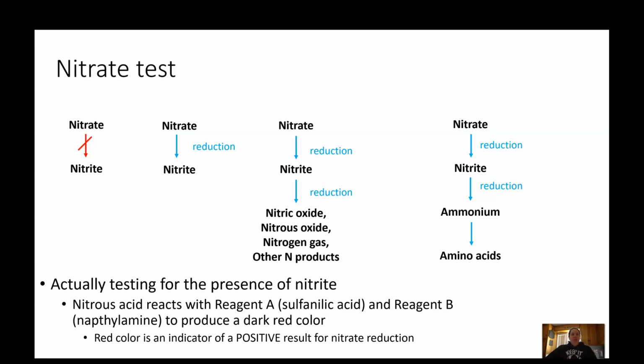And it's important to point out that even though this is called the nitrate test, what we're really doing in the actual test is testing for the presence of nitrite. We're testing for the presence of this reduction product here. And the way that we do that is nitrite in solution turns into a very weak acid called nitrous acid. And nitrous acid is going to react with sulfanilic acid and naphthylamine.